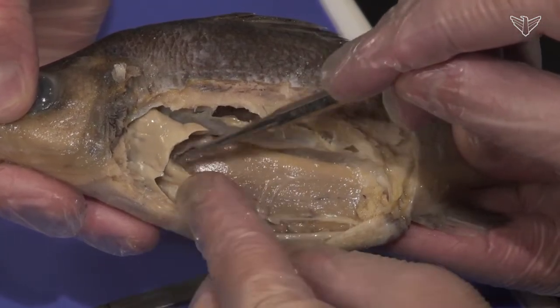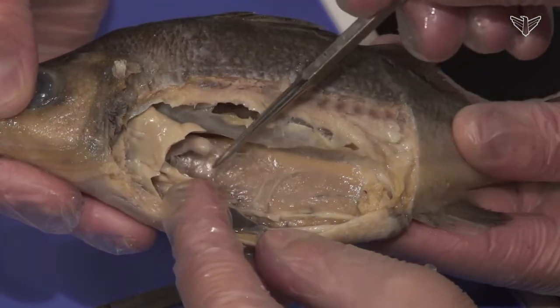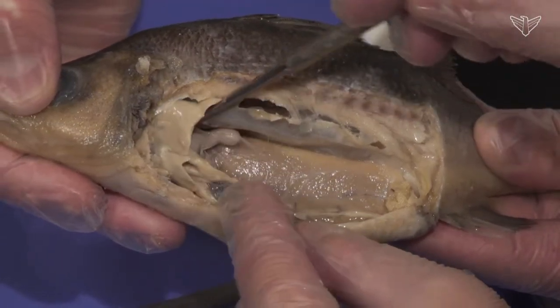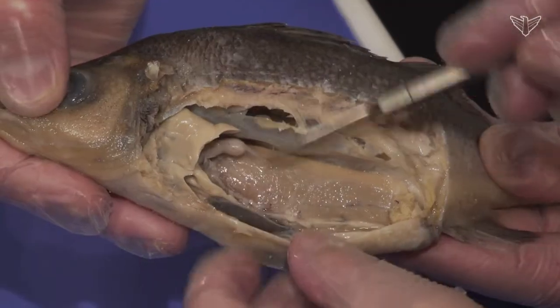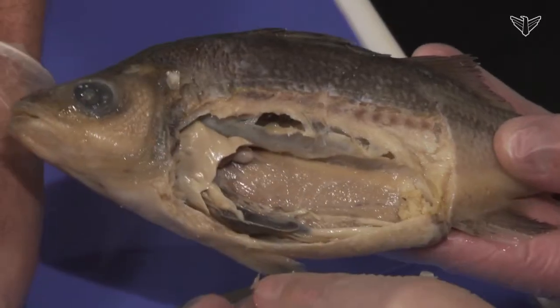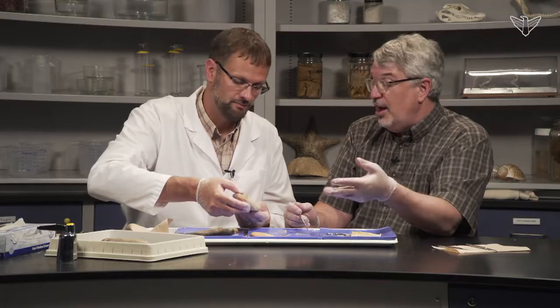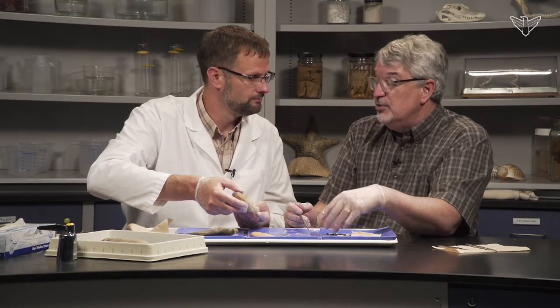Here's the digestive system under that — the intestine. And here's the stomach back here. You look at a book and it isn't always exactly what you find, just because of the season. Depending on the time of year you caught it, those gonads might be very reduced in some cases.